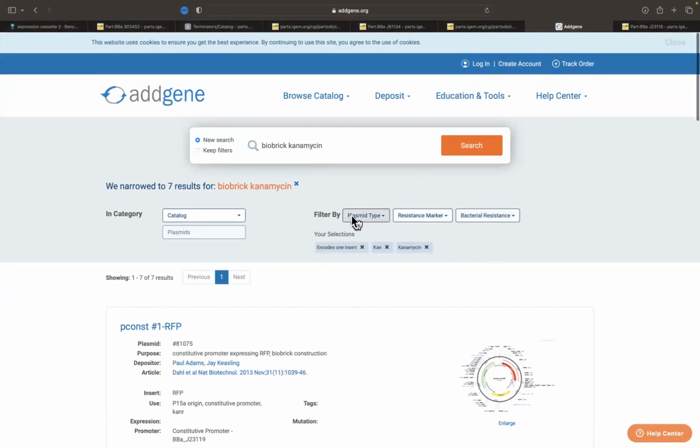Okay, so I'll let you play with the filters and play with the BioBrick keywords. You can also look for more specific naming if you already know what to look for. And then I would say maybe 5 minutes, and whatever you can find.